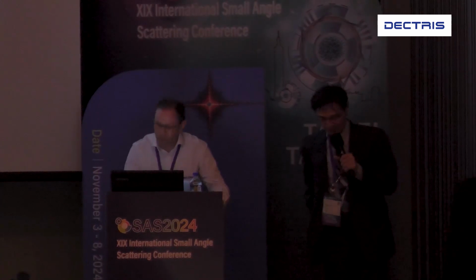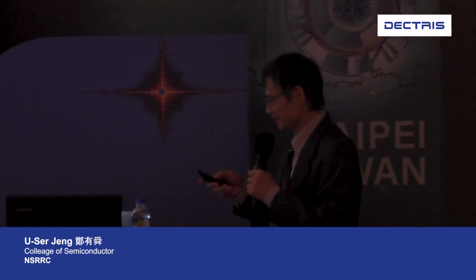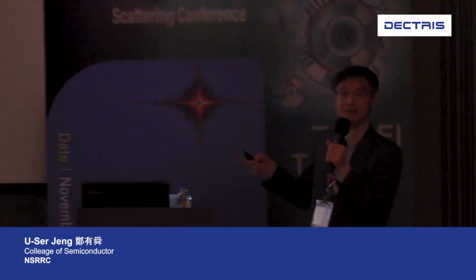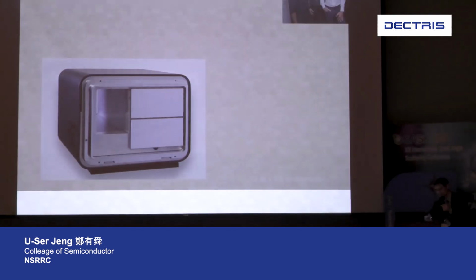So I actually bought a detector long ago, back in 2010. This is our design for the TPS 13A with 2 detectors in vacuum. That's the original idea. So they can move back and forth and go anywhere you want in the space.